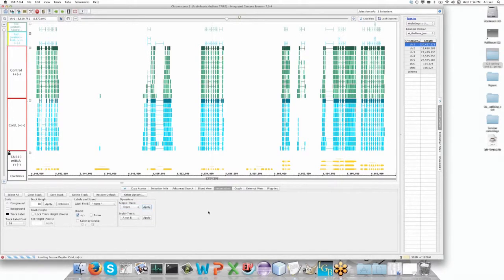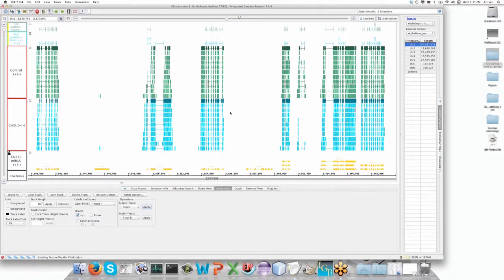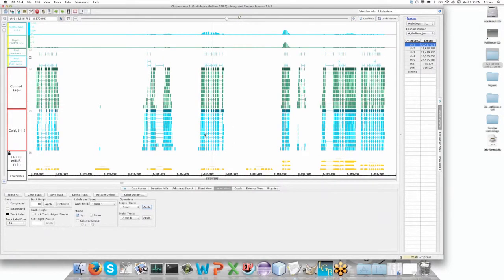What this is going to do is create a graph — not an annotation, which is a model representing your data — but an actual mathematical graph. A depth graph is a numerical summary of every read that's stacked on a nucleotide across this region. It will take all of those reads, those very tall stacks of reads, and render them down into a mathematical output.